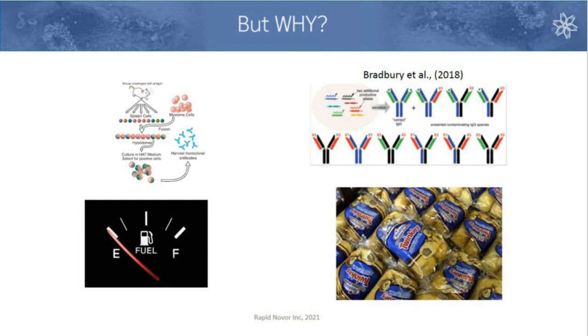But further than that, if you actually decide to go into the hybridoma and try to sequence it, you could actually see the wrong light chain present in your sequencing data. And of course, if you try to create a recombinant and express that antibody, you're going to find that the recombinant antibody that you derived from that genetic sequencing data is actually wrong as well. And thus you say, oh, well, what do we do now? Those are usually the best options to exercise first, but in the absence of those solutions, you might want to consider something like protein sequencing as well to capture that antibody.